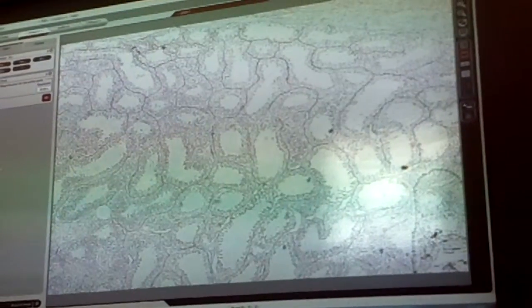Are those the testes? Okay. This is a different slide than what I use. But it's still pretty circular. That one kind of looks like a line. Let me see if I can get a Julie cam here. Oh, here it is. Oh, wow.